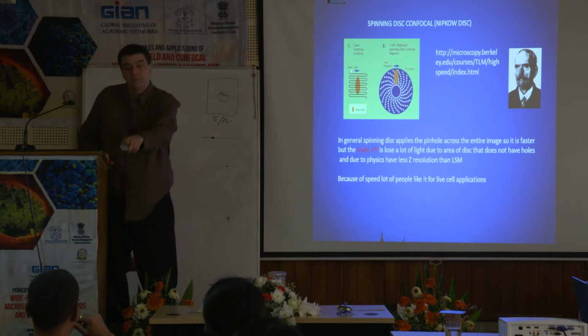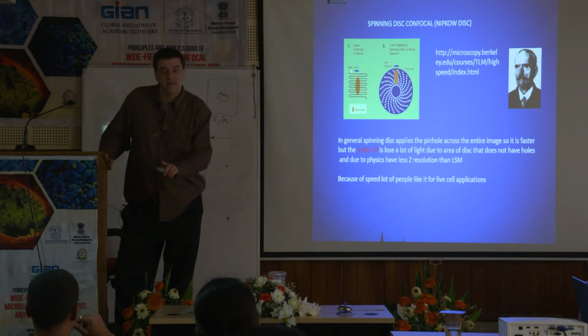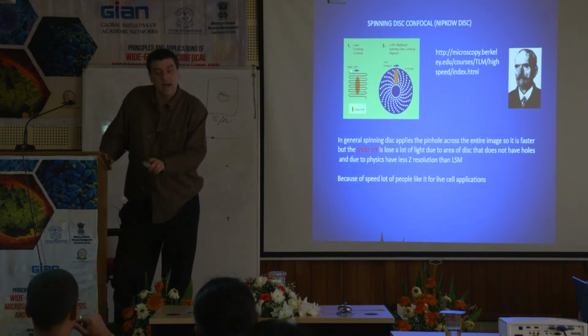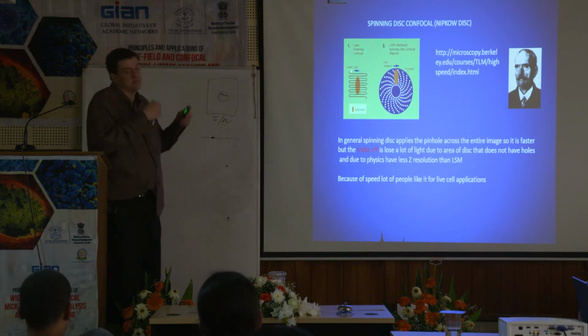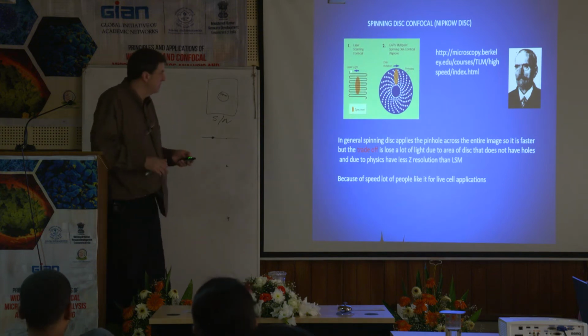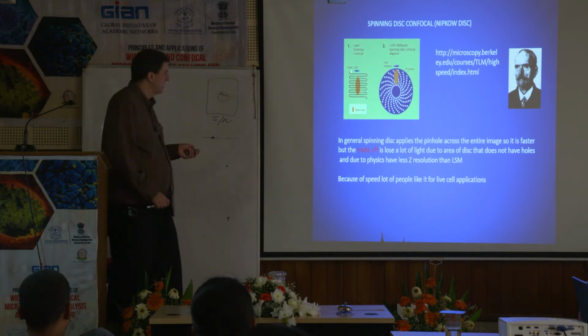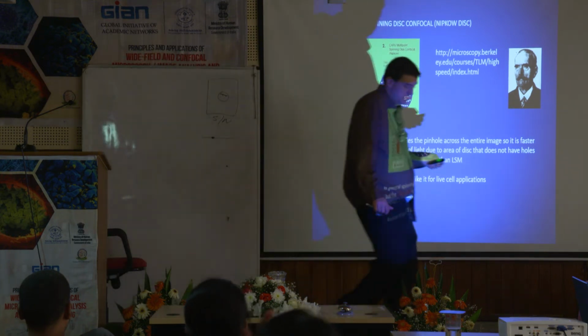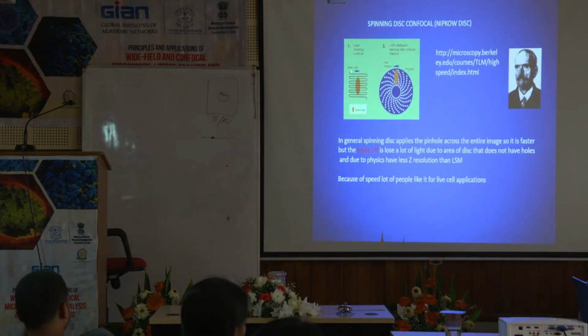So the question you're asking is going to be addressed right here, a different kind of confocal that does a better job of live cell, okay? Good question, but this is sort of the answer to what your question is. Okay, so there's actually a confocal called a spinning disc confocal. I have one of these. I think you used to use it, didn't you, Srijit?